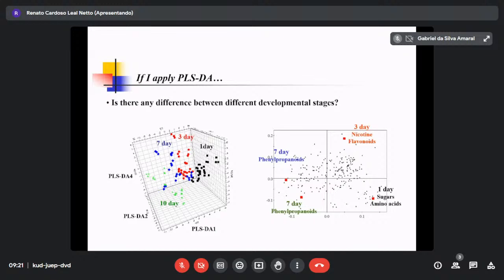But that is actually not one. I treated this like a nationality, which means 1 day, 10 days, there is no correlation, only different concepts. But instead, if you give an age effect, 1, 3, 7, 10, you have only one variable. Now this one is 1 day, 3 days, 7 days, sorry, 10 days. But as it is, it's not very understandable.